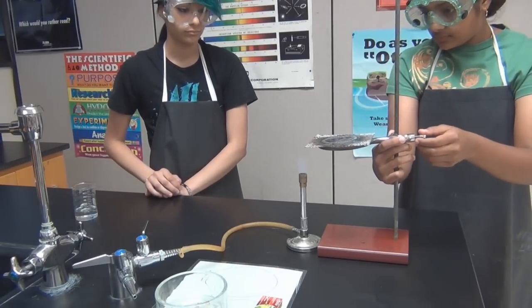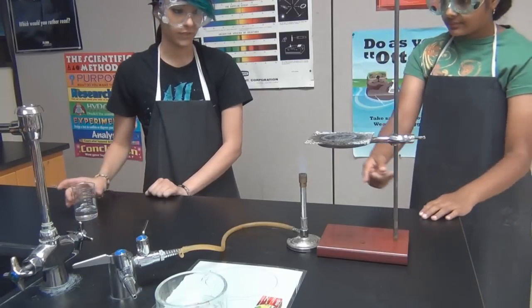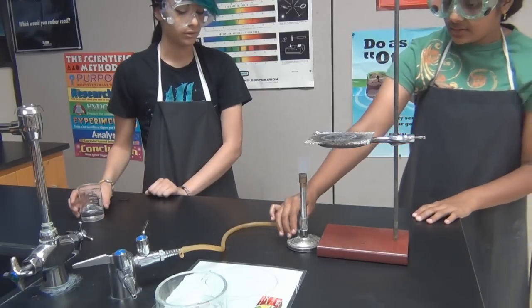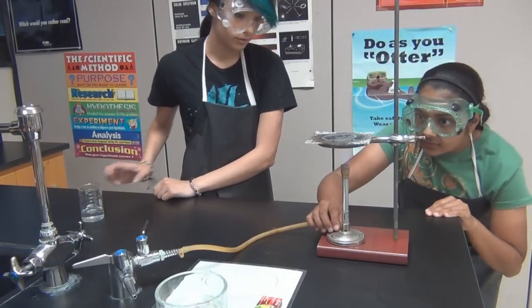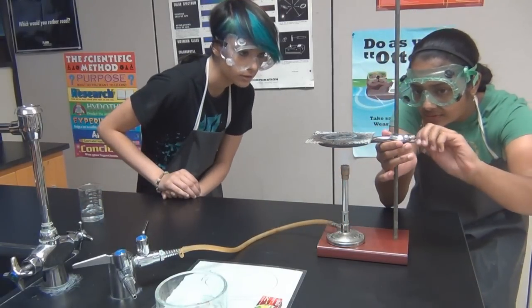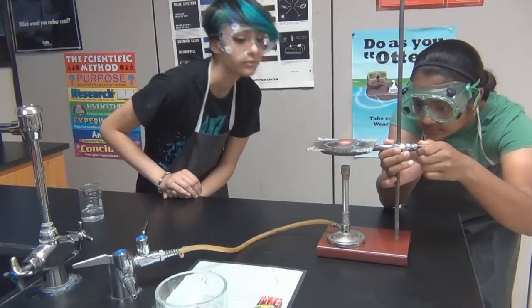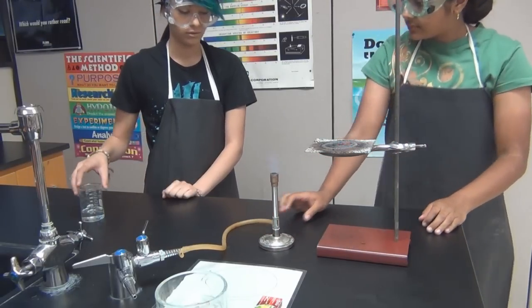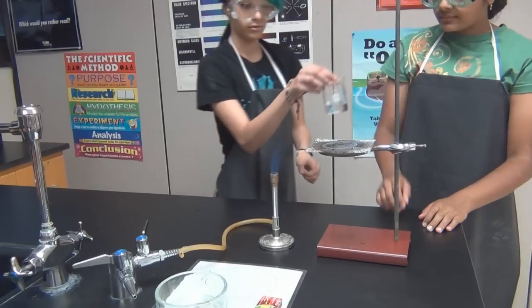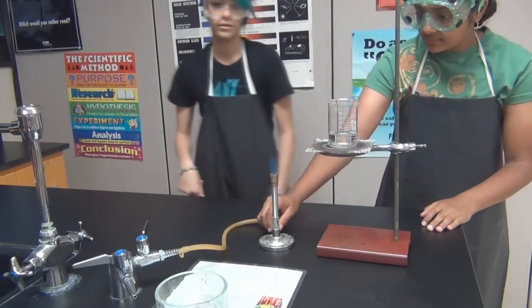Adjust the ring to have it just above the blue cone. Then put the burner on the base of the stand and adjust more if needed. Now move the burner from the base and put the beaker on the wire gauze. Then carefully put the burner back.